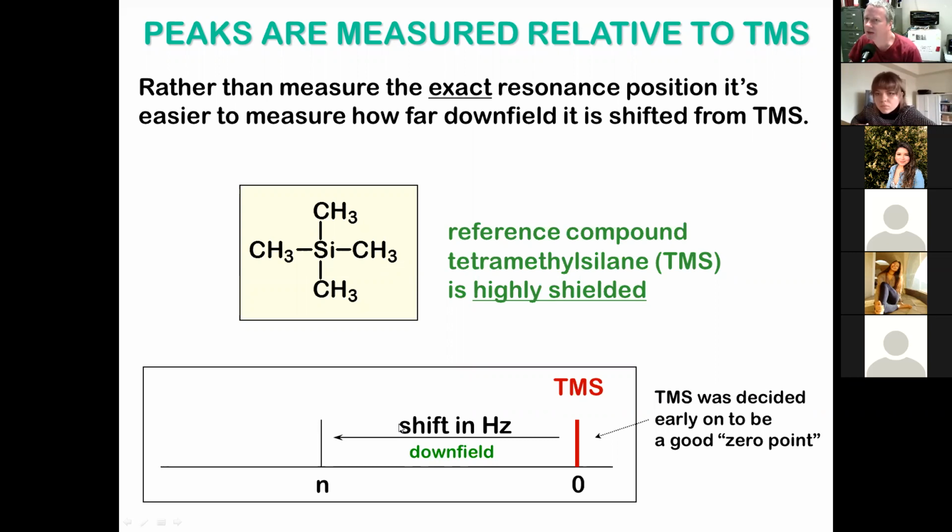Remember how last lecture, the hertz depends, with the Larmor equation, on the spectrometer frequency, the magnet strength? So that's not ideal. We'd rather have a universal measure that's independent of the magnet. So we're going to define the x-axis a little differently. This second it's hertz, but it won't be hertz in a second.